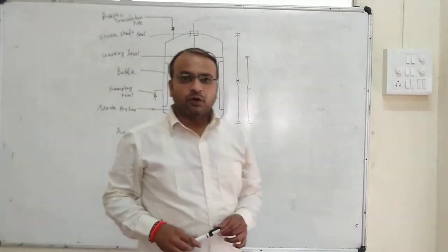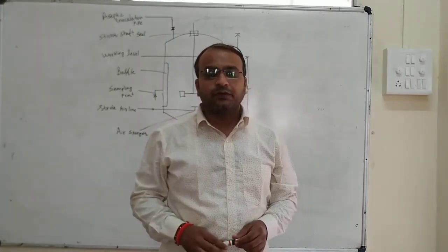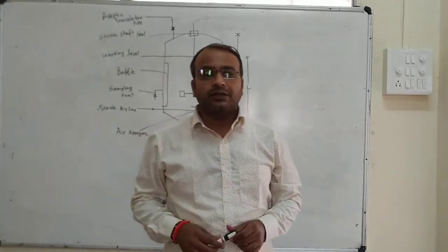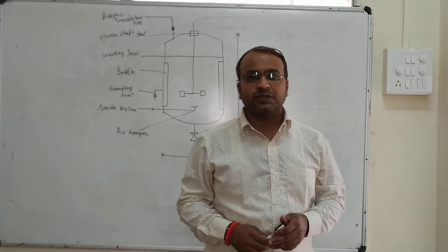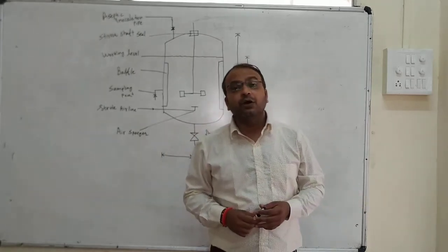So, welcome you all to the second lecture of this bioprocess engineering. As we have discussed in the last lecture, the instrument which is used for the bioprocesses, or we can say the biological processes at a commercial scale, is called a bioreactor.